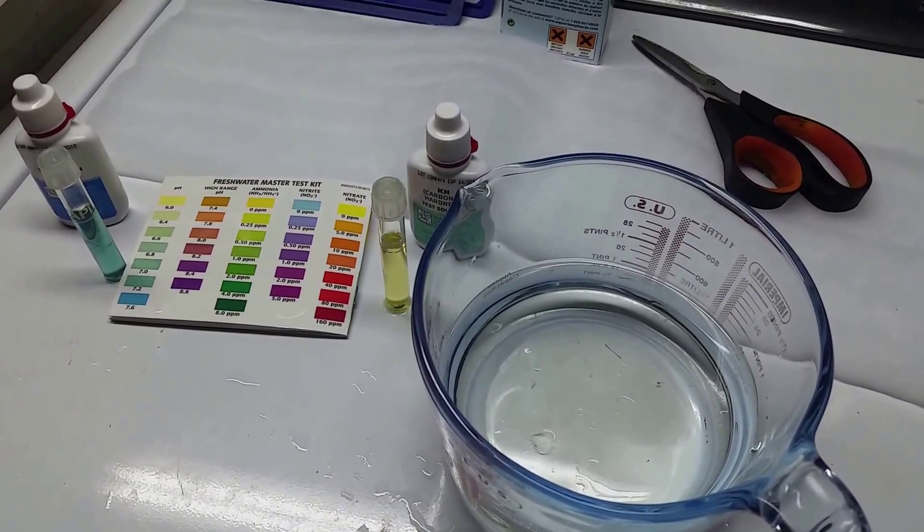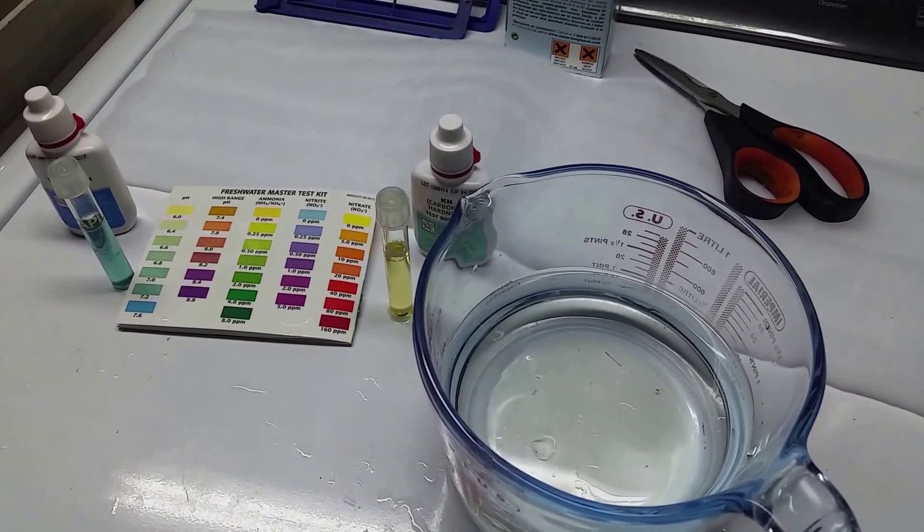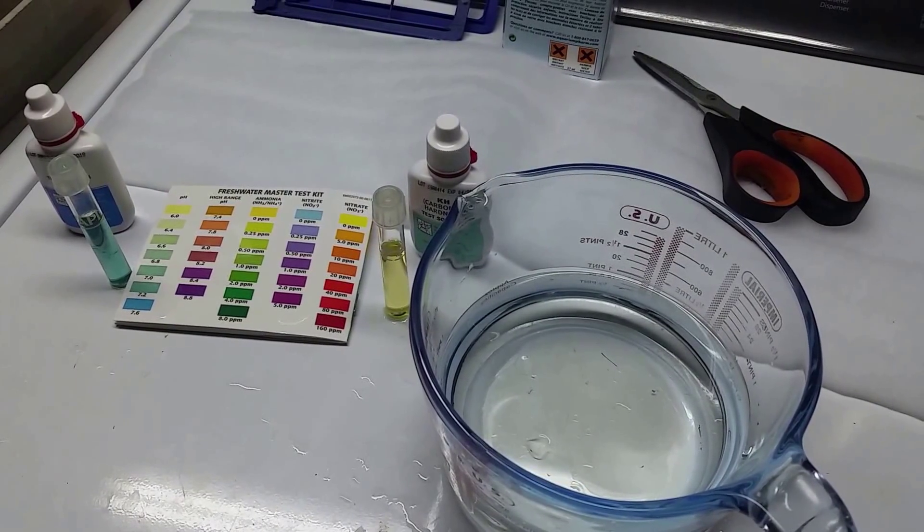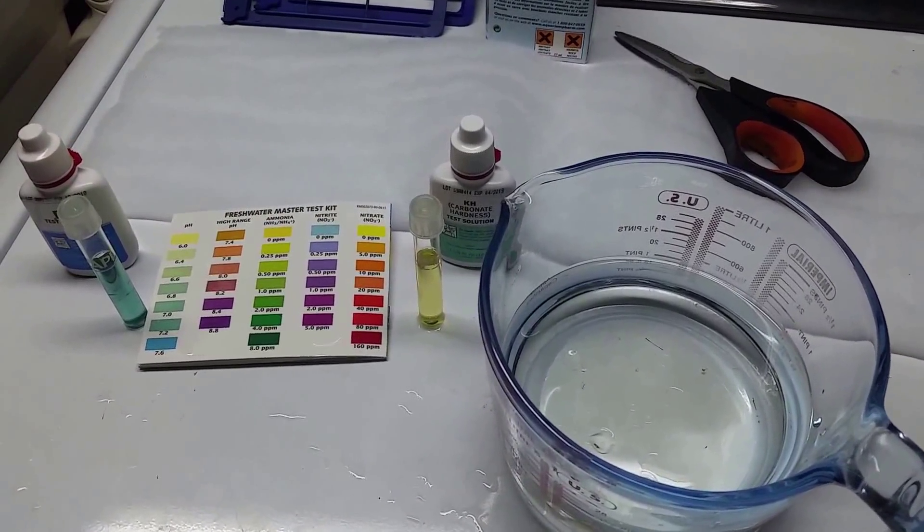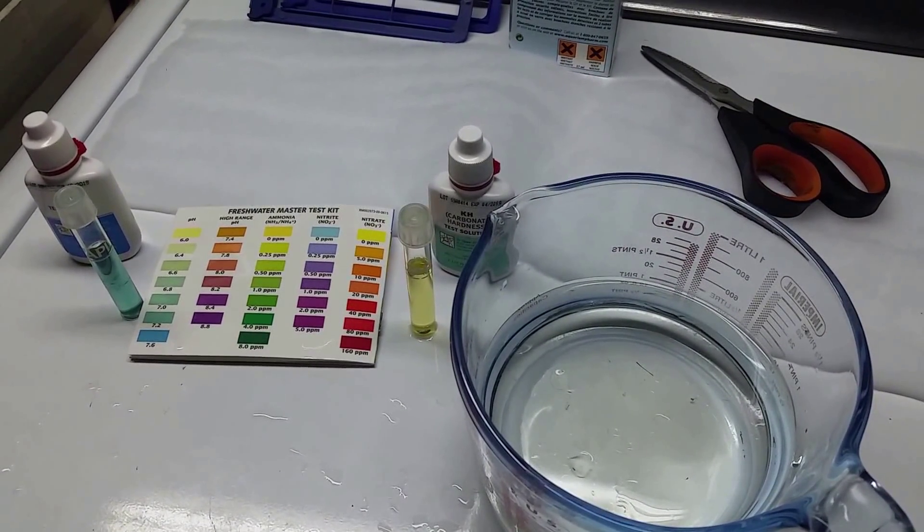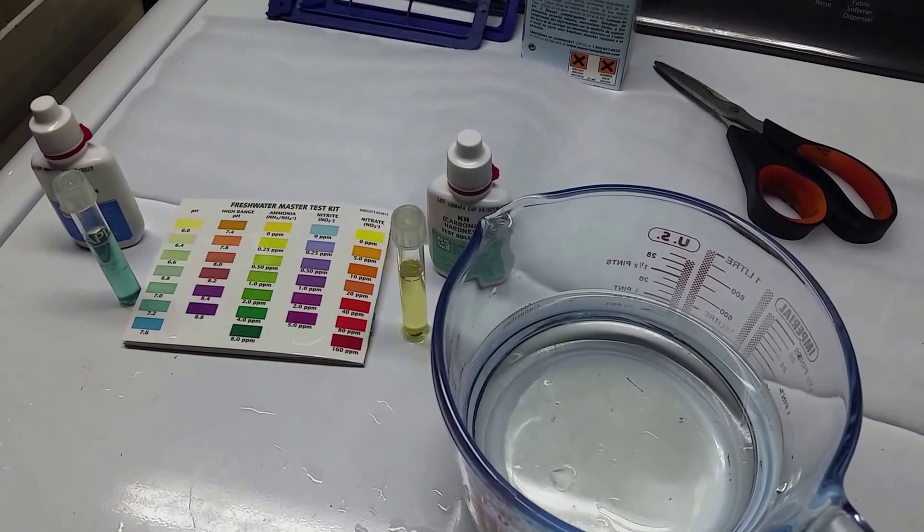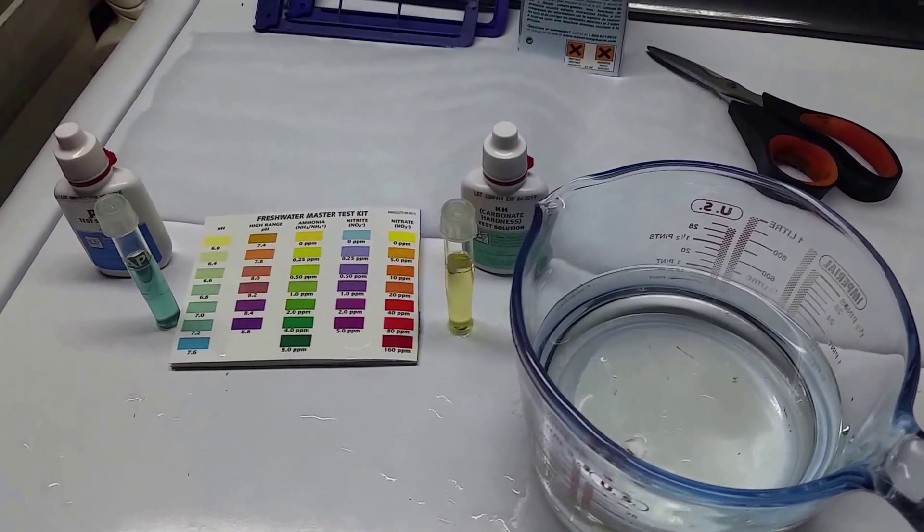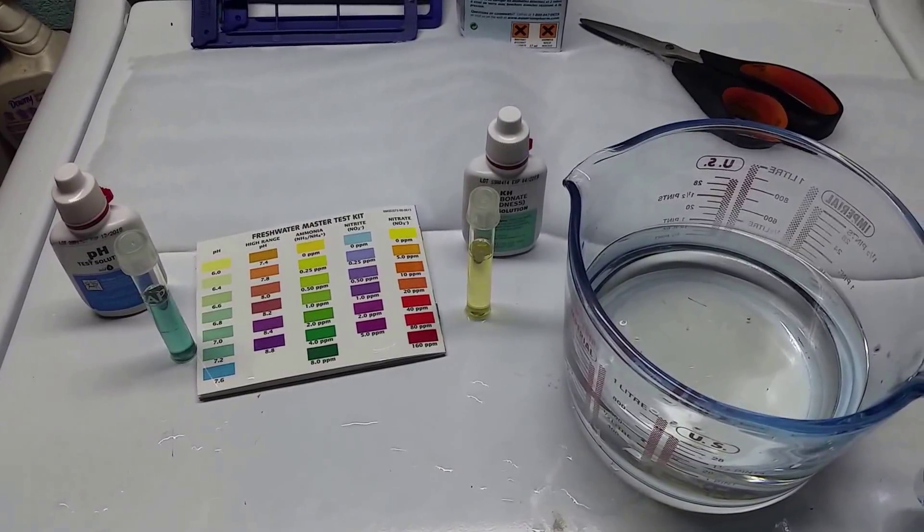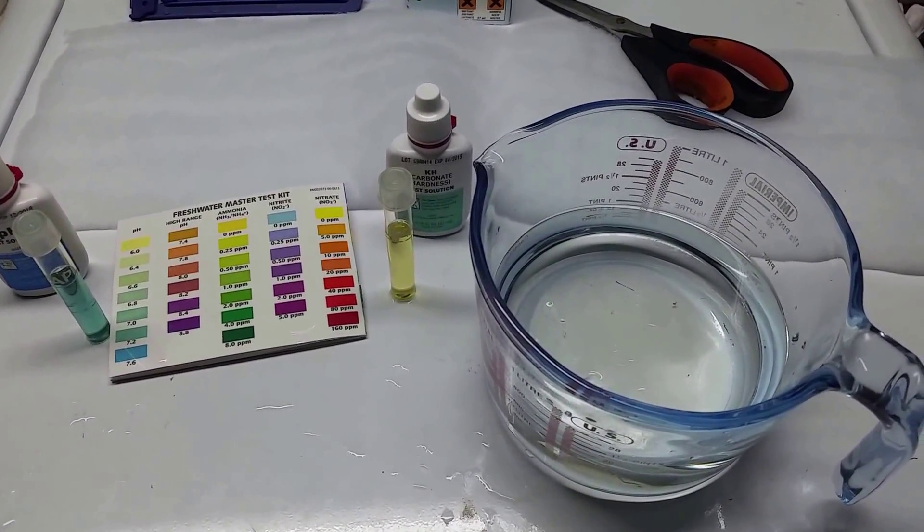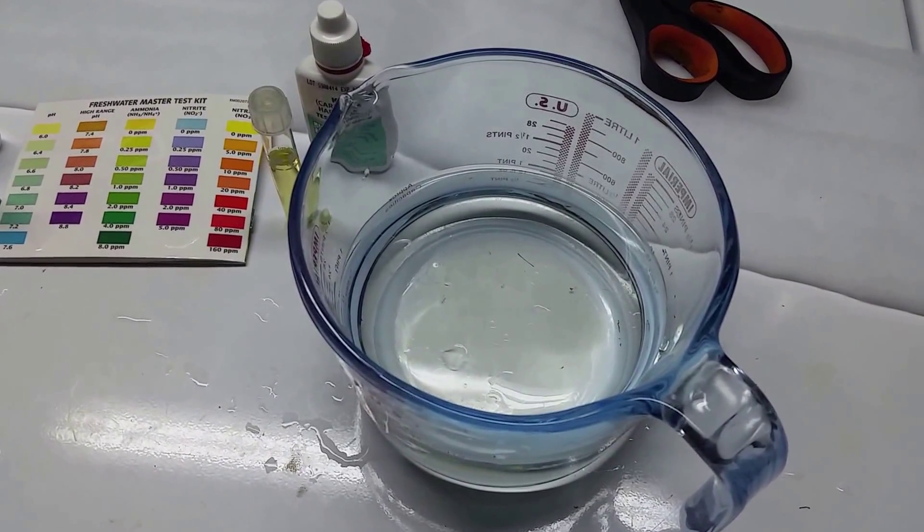The way the carbonate hardness test works is you take your sample of water, put drops in that turn it blue, shake it, and count each drop. When the water suddenly turns yellow, that number is your carbonate hardness. In this case it was the third drop, so I have three degrees of carbonate hardness and a neutral pH, which gives me an estimated CO2 value of 10 parts per million.